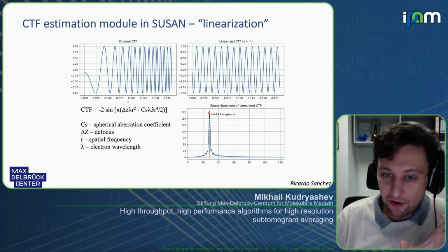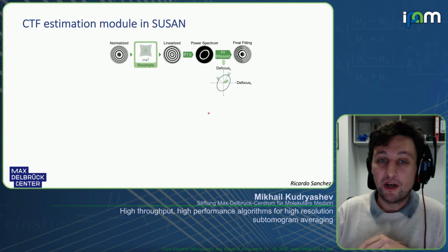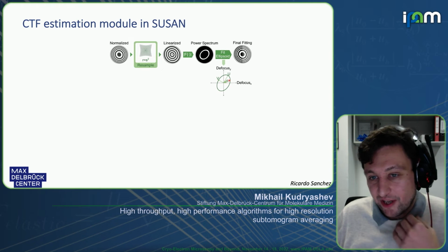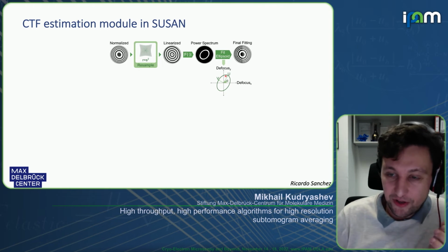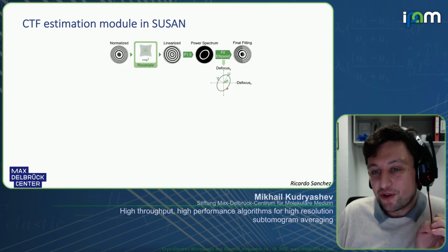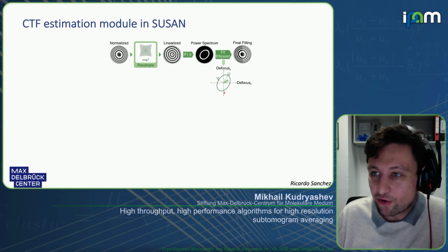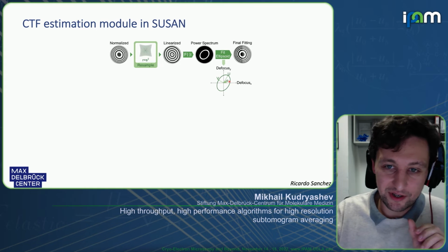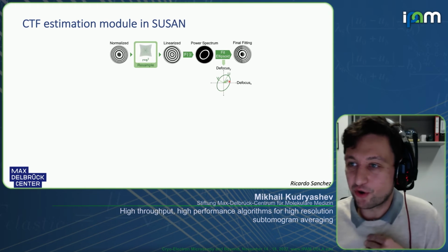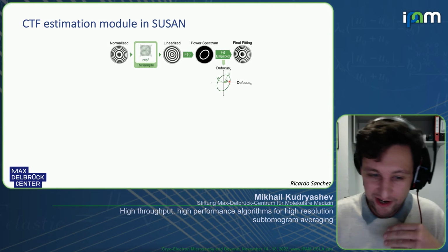Obviously, he doesn't do this in 1D, because you can still have a little bit of astigmatism. He does the fitting of an ellipsoid with small and larger axes, but this is very quick. So he does still need to refine this, so he only does this fitting for the initial detection of the defocus and the direction of the astigmatism. But because the precision of this linearization operation and Fourier transform is equal to 1 Fourier pixel, he still needs to refine it a little bit.